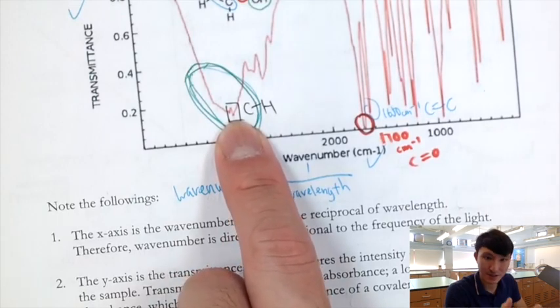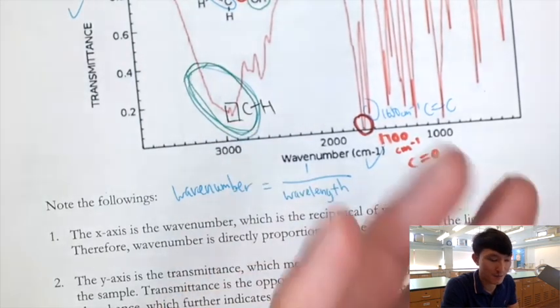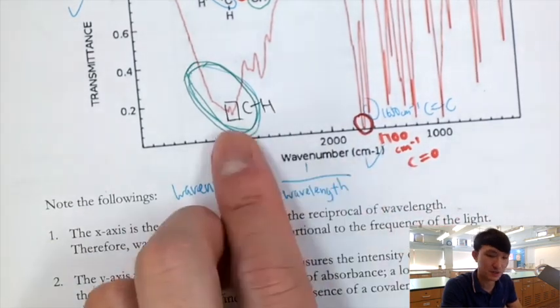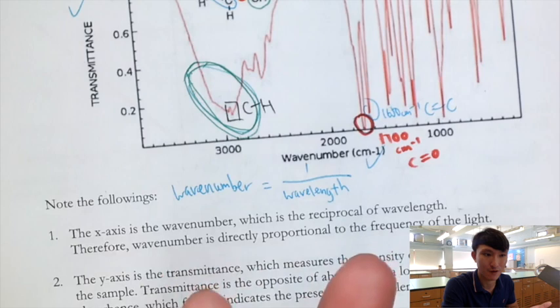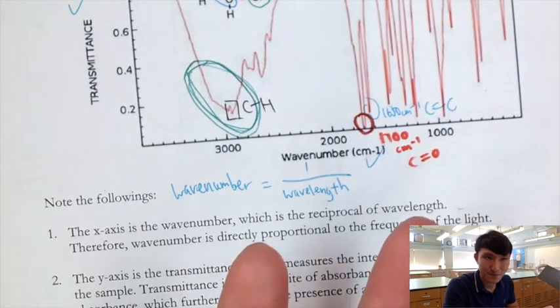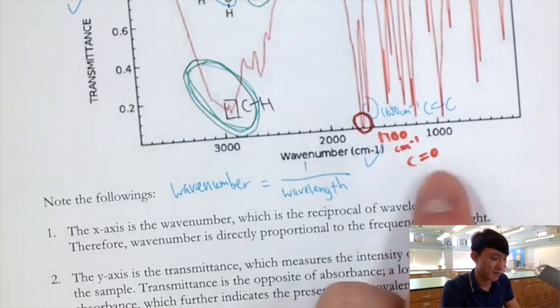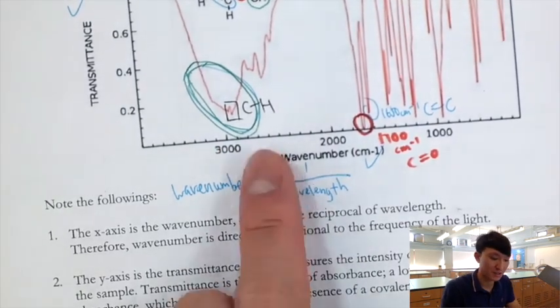But the question is, is it useful? To be honest, which organic compound does not have a CH? Most organic compounds will have a CH. And the presence of CH is not really helpful for our deduction. It's not even a functional group. So like I said, most of the time we are looking at either 3 wave number ranges or maybe 4, including this one.